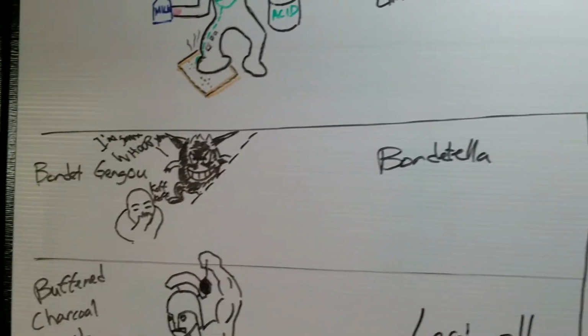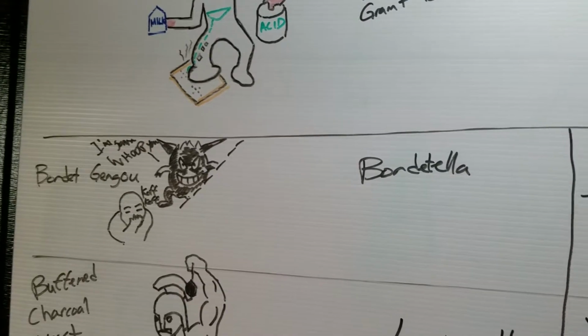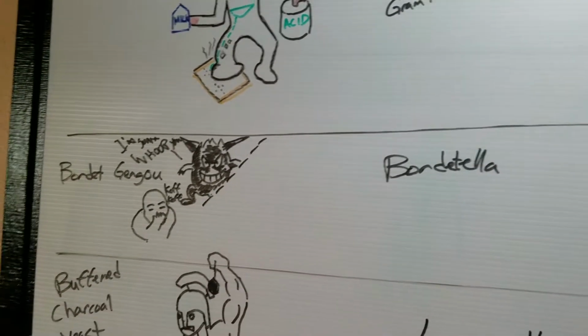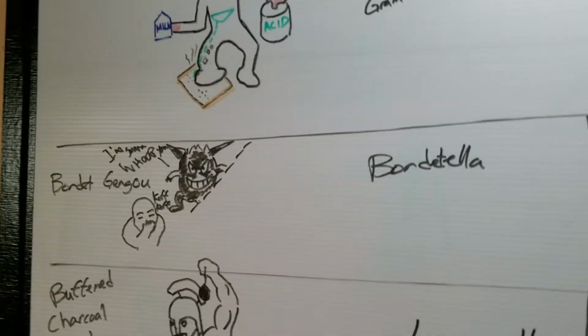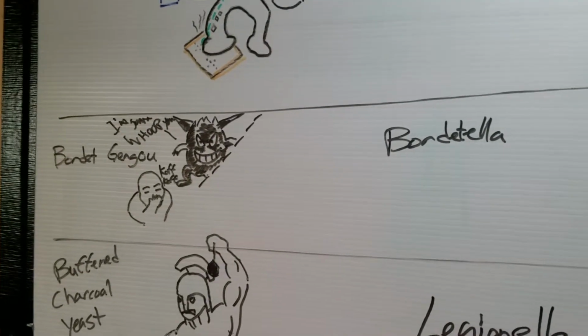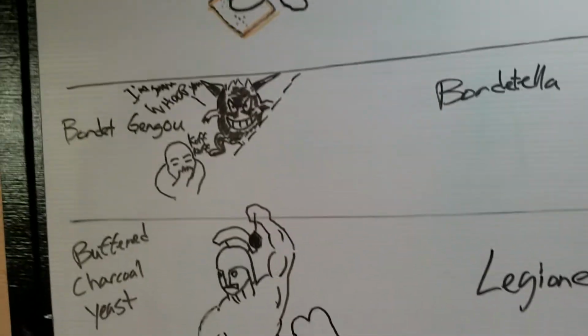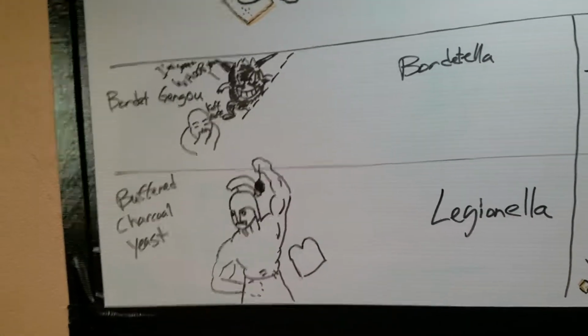Okay, so the question could go, someone comes in, they have a cough. You run a swab, the agar plate, and which one do you choose to run? He has suspicion of having whooping cough. Well, who's whooping? Who's coughing? Which picture is that? That's the Bordet-Gengou. Okay? Let's move on to the buffered charcoal yeast.